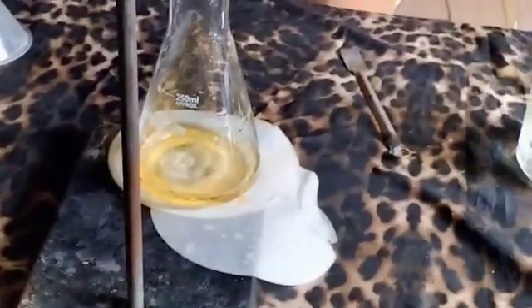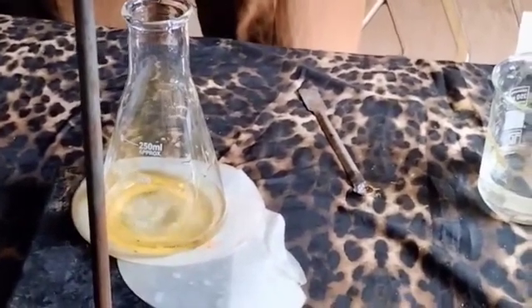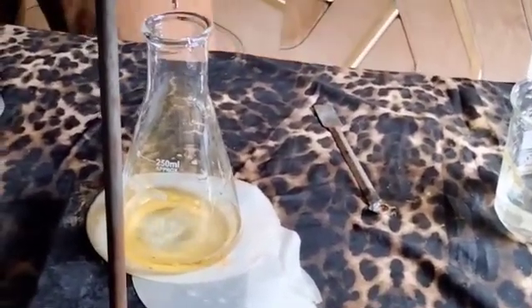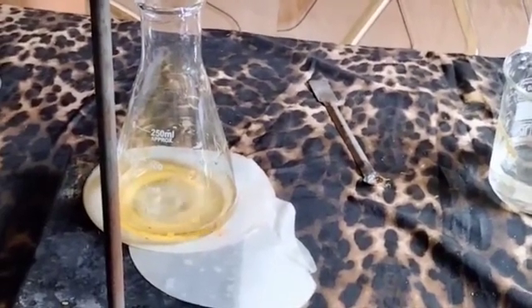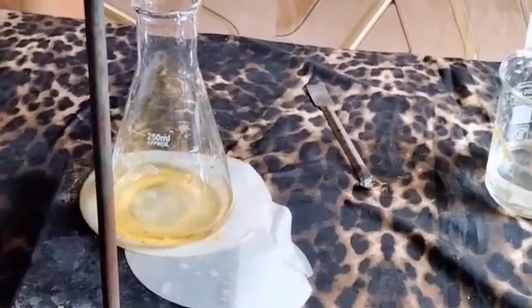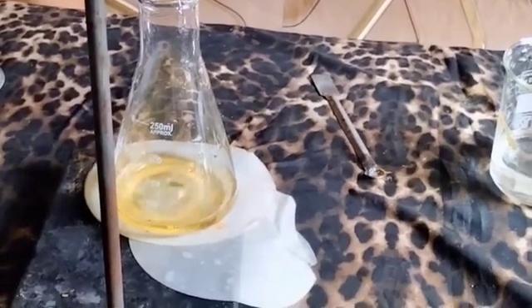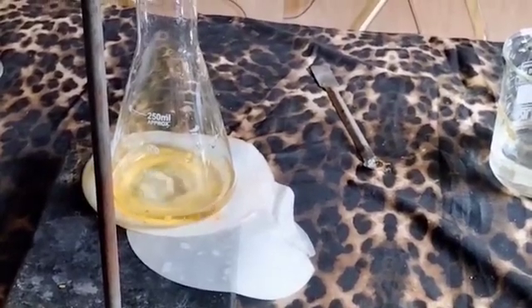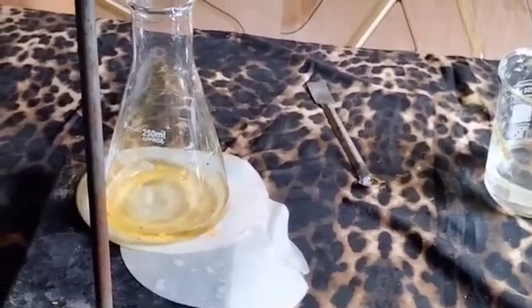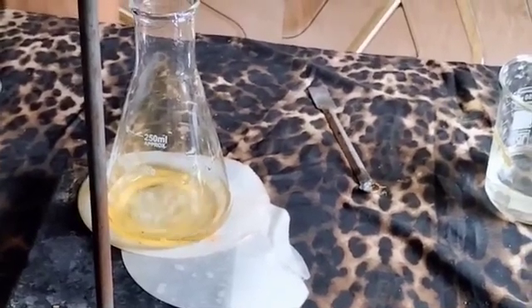So we can increase the rate a little. I like to go slowly and see when we are going to reach 21. When it reaches 21, I will close the tap. Then after closing the tap, I'll take it slowly and move to the end point and observe the color very well. So it's moving to 5 whole number.